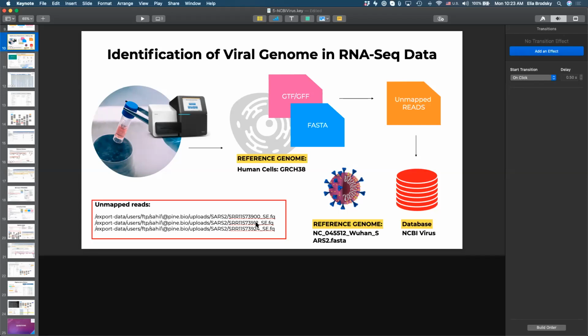And on purpose, we're pausing this because FASTQ files or SRR files are going to be much, much larger than the genomic files that we will look at today. Because today we're going to look at, again, how to do multiple sequence alignment and how to download those FASTA files, first of all, which are assembled genomes from NCBI Virus.